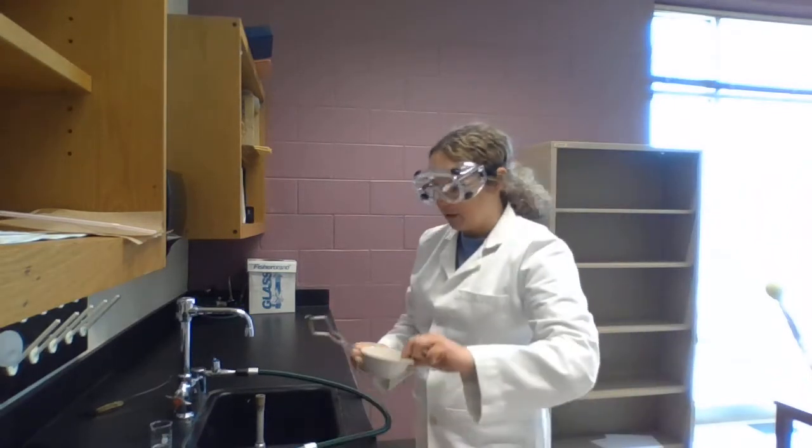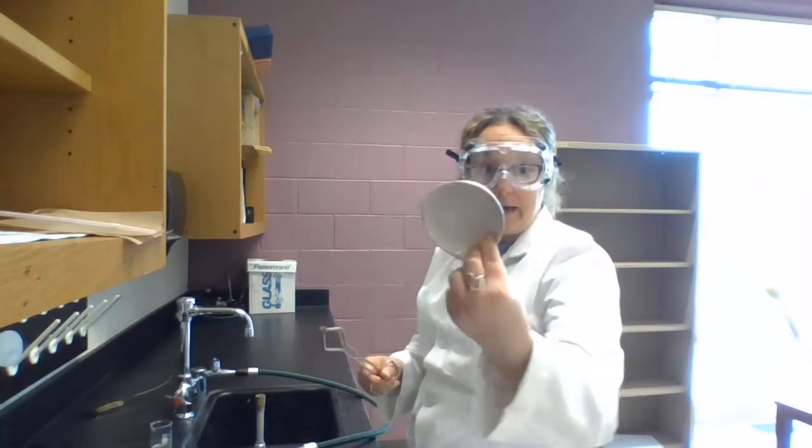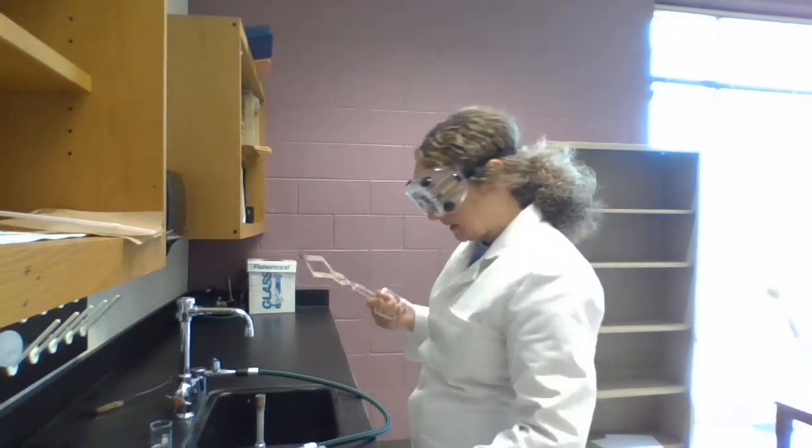All right, and I'm going to burn my magnesium and I'm going to hold it over my dish so that we can catch the products.